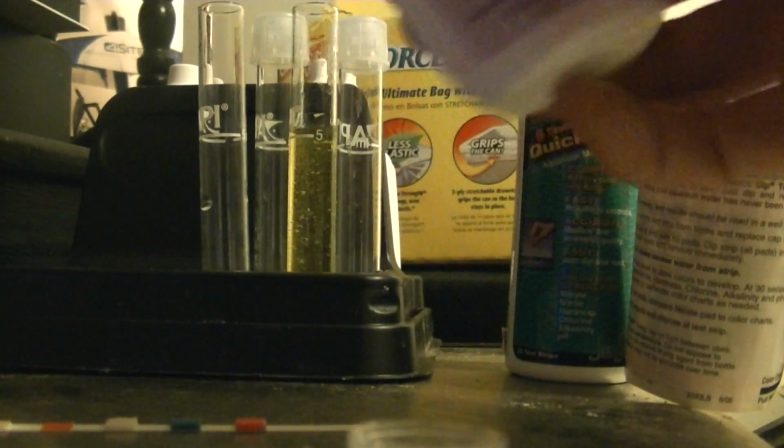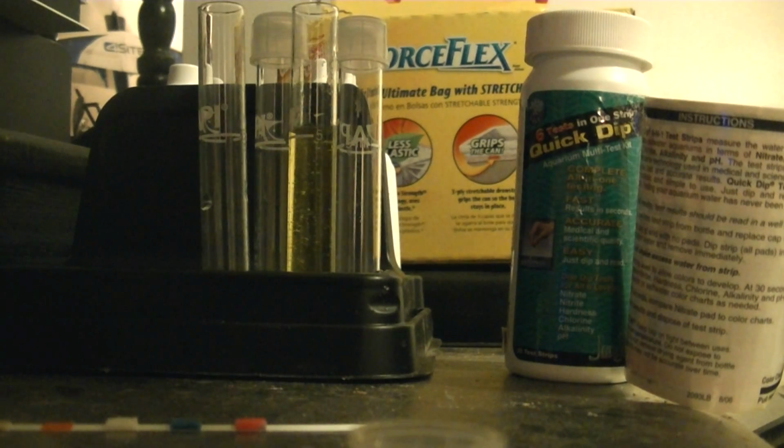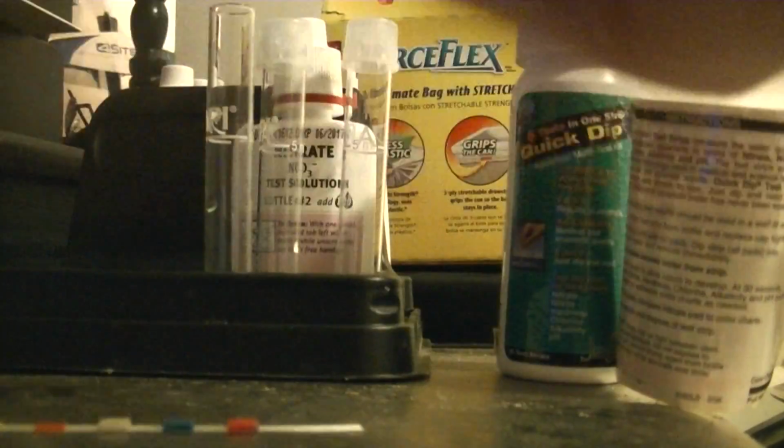Now I put in 10 drops of the second bottle solution for nitrate. I cover it, swish it around a couple times, and now shake it for up to a minute, it says.